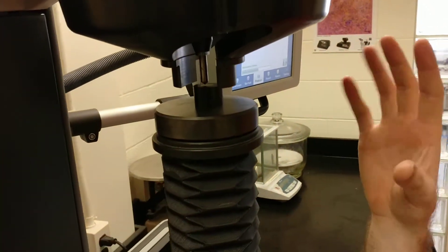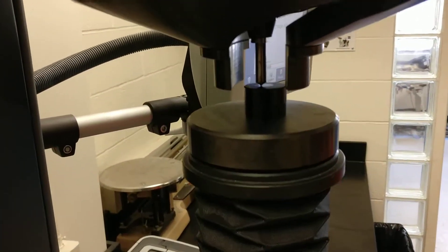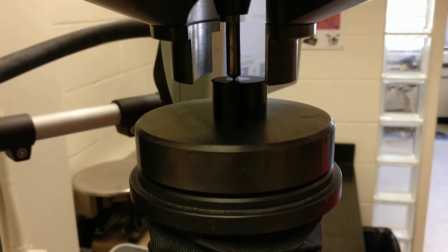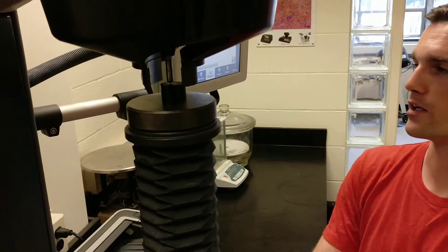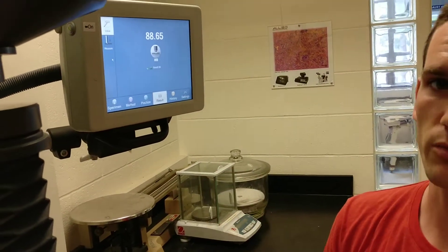It's going to auto-rotate the turret to choose the correct indenter, then lower the indenter into the surface. You want to make sure that you're at least two diameters of indentation away from any edges and away from any other indents in your sample, as denting it hardens the area around it. It's very quick — at the end you'll see your hardness number, reported as HRB 88.65.